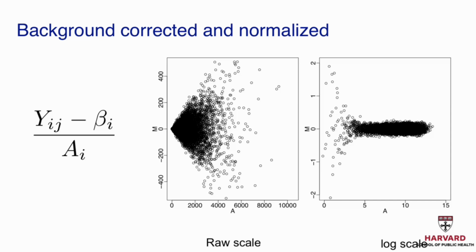There's still a problem. If we do this, because of the multiplicative effect, and we make an MA plot comparing the intensities from sample 1 to the intensities from sample 2, we can see that the variance grows with the mean. It's very clear. That's something that we have seen before, and it's one of the reasons why we take the log. Now, VSN is an alternative to taking the log. Why do you want an alternative? Because, as we have seen before, if you take the log of a quantity like this, then you get an explosion of variance for the low values, as predicted by the simulation based on the VSN model. So we have an increased variance in the raw scale, increasing with mean value, and an increase in variance for low mean values if you take the log.